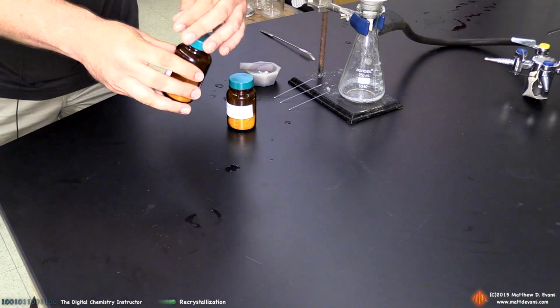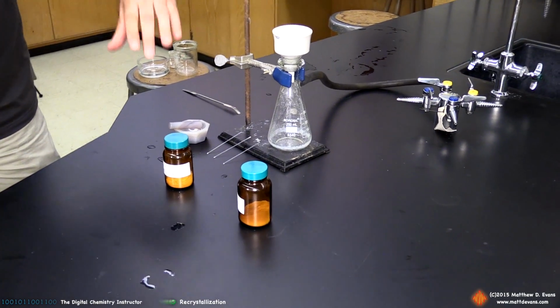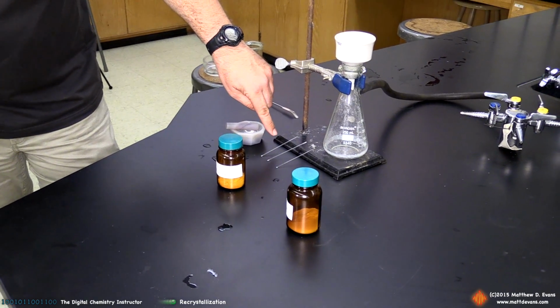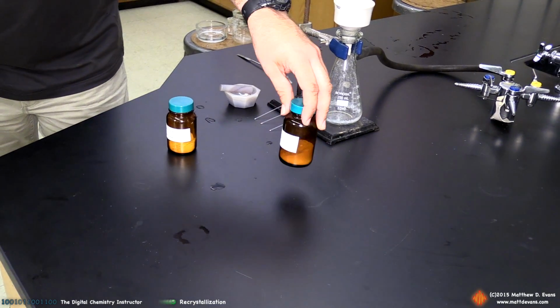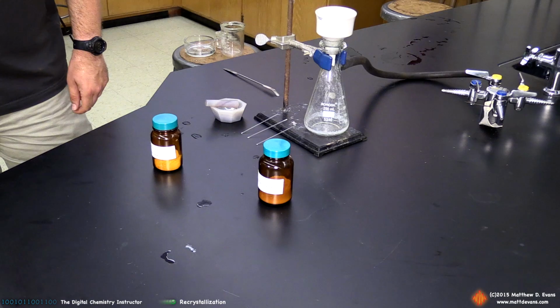Just to recap what I've done here, I've taken my recrystallized crystals. They were rather needle-like, so I felt it necessary to crush them down a little bit in this mortar and pestle. I made a capillary here. I took some impure, the original impure sample, and made a capillary of that, middle. And then I've got some store-purchased sulfanilamide. This is highly pure. Made a sample for that so I can check my melting point.